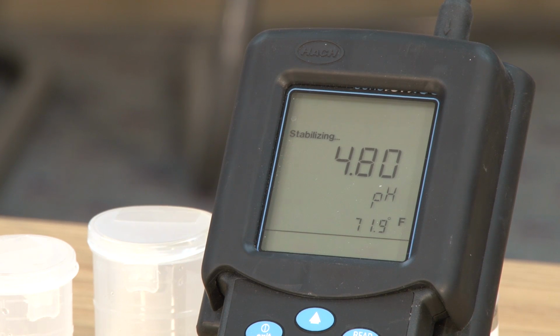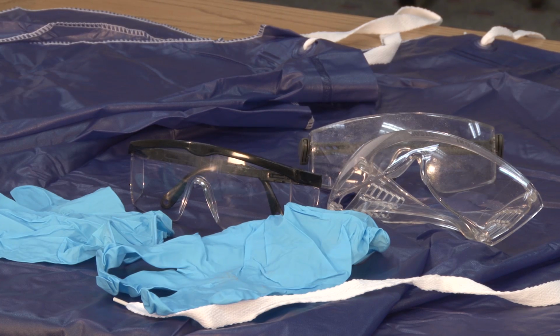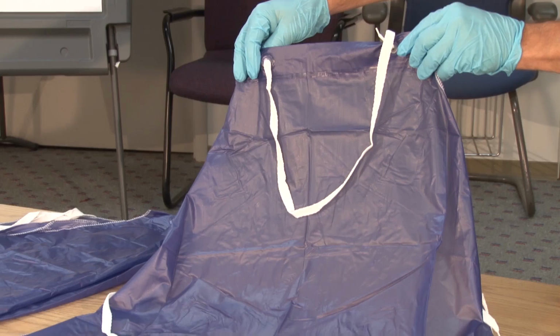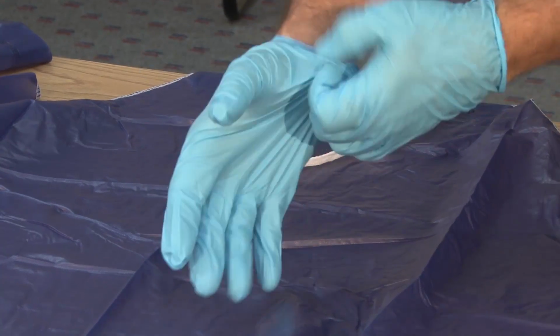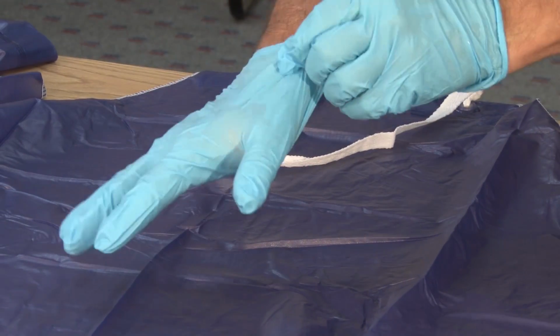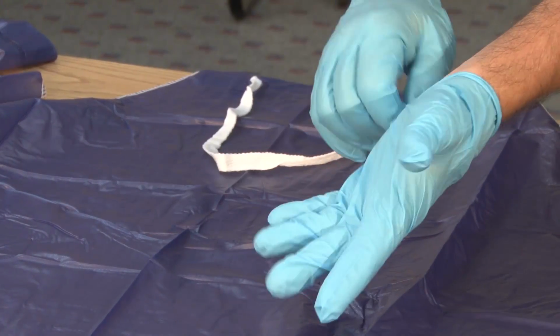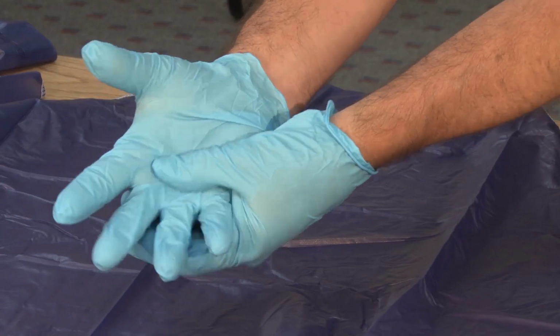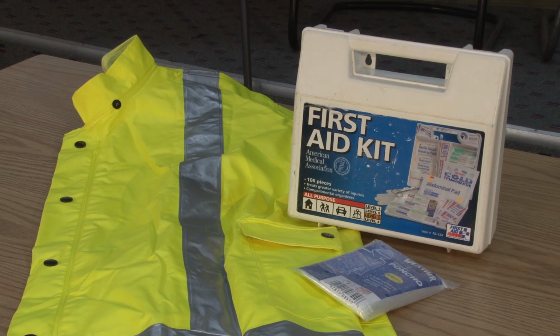You will also need proper personal protective equipment, or PPE. PPE includes safety glasses, aprons, and nitrile gloves. These powder-free gloves are recommended for personal protection because of the unknown composition of the stormwater discharge and to prevent sample contamination. In addition, you should have a first aid kit available that has been tailored to your particular part of the country and outfall environments.